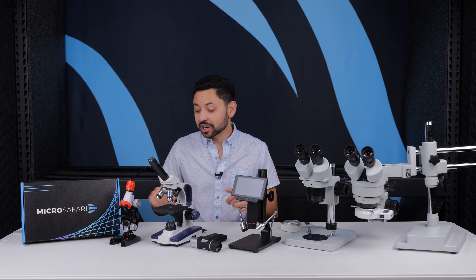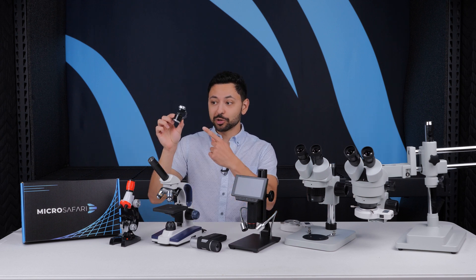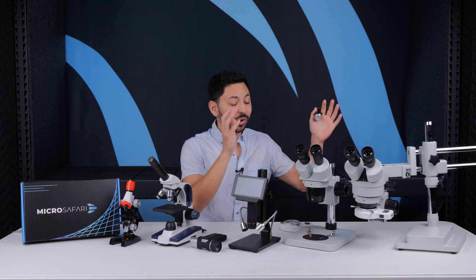What microscope should you get for your kids? My biggest recommendation is that you either get a smartphone microscope, a digital microscope, or a stereo microscope.